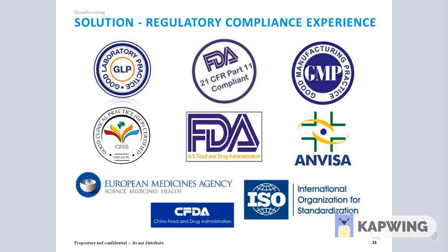The LIMS platform must help ensure compliance with all major regulatory acts and agencies, national, regional, and global. The pictures I've got on the screen show some of these governing bodies, but I stole this from a slide from a presentation done for the US, so you can see the FDA is right up there in big lights. Obviously, the European Pharmacopoeia is of major importance for most businesses, and if you are selling to Aussies like myself, so is the TGA. That's our version of the FDA.